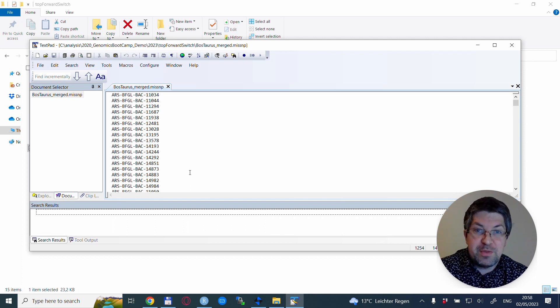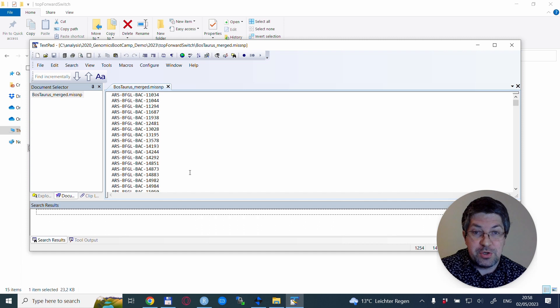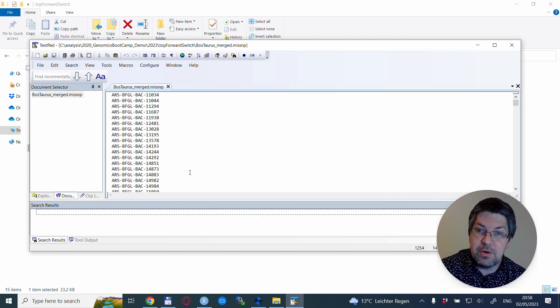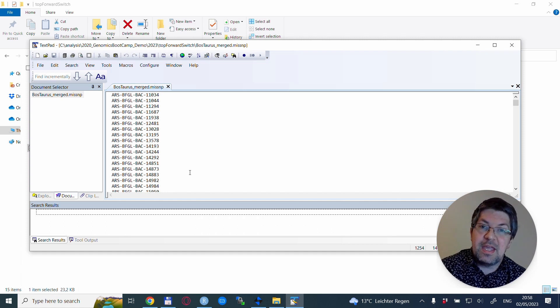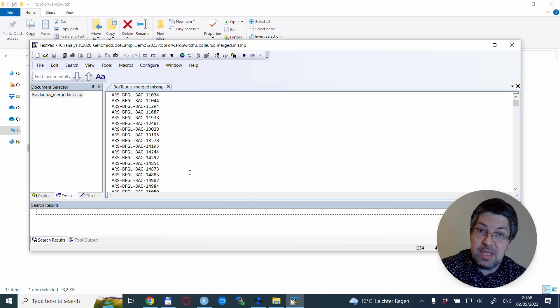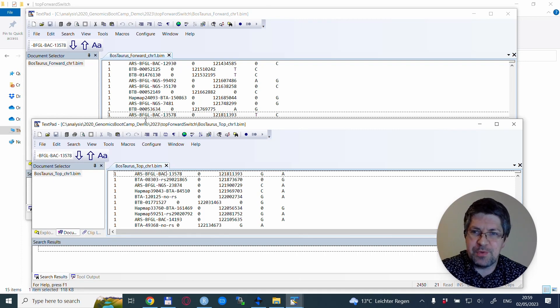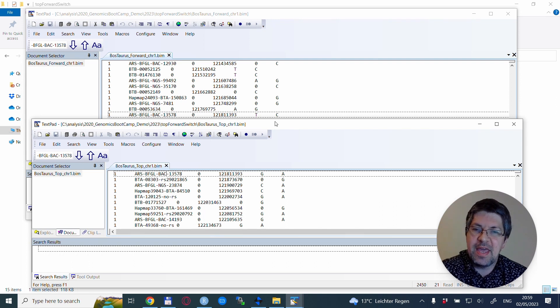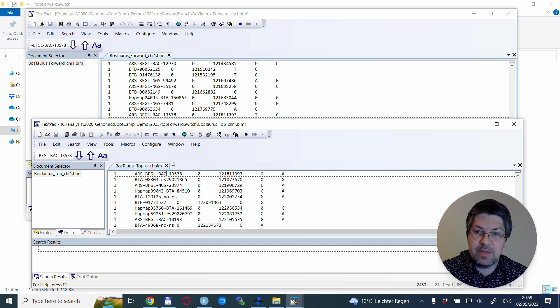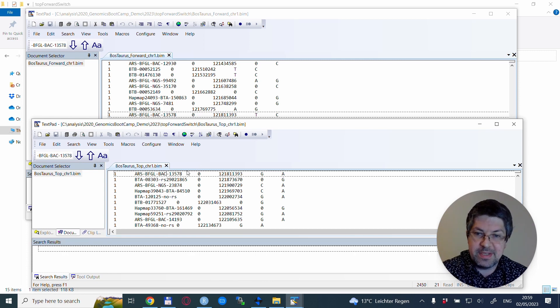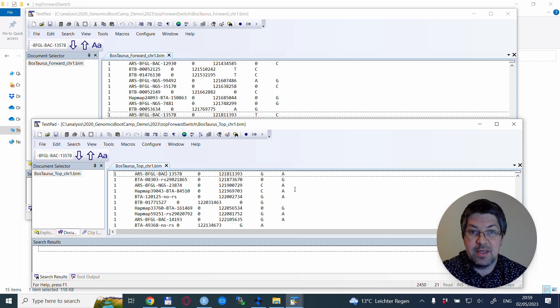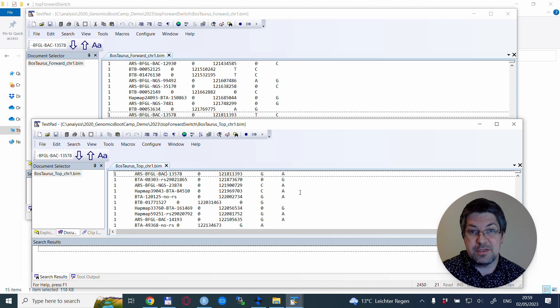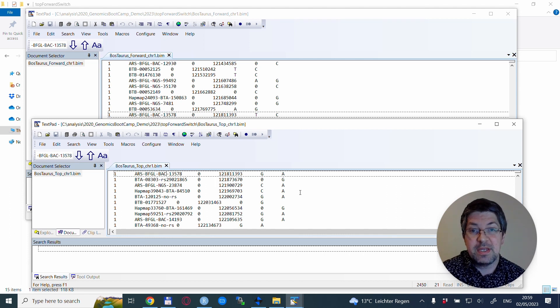To ensure that we have a different allele coding, we can take any of these SNPs and check them in the original data files. I selected this ARS13578 and you see in the forward dataset it's a TC SNP, and in the TOP dataset this same SNP is a GA SNP. The alleles are different because for some SNPs the alleles are very different in TOP and forward coding.